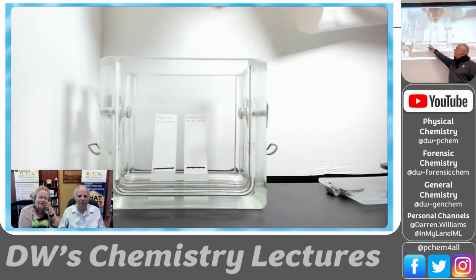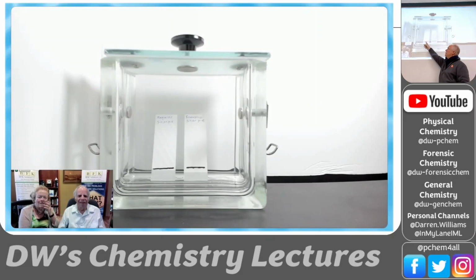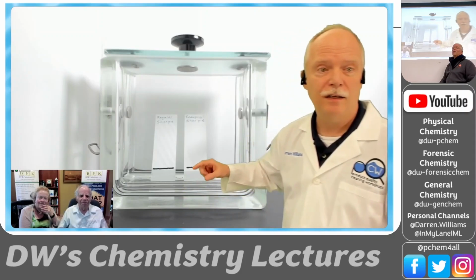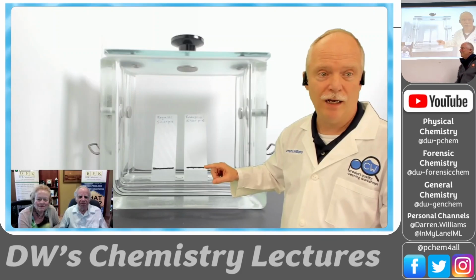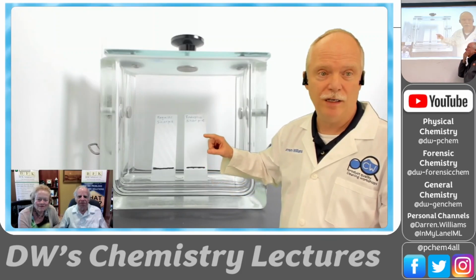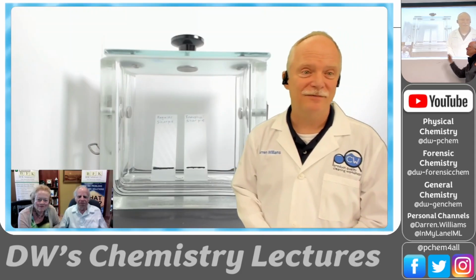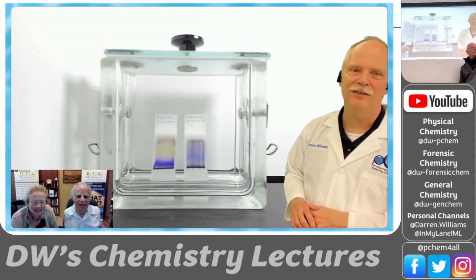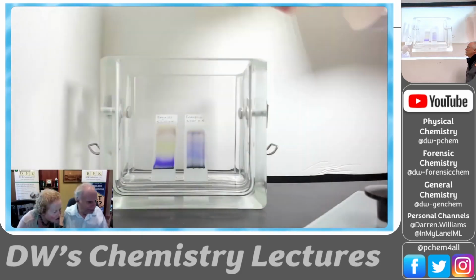You can see the solvent already moving up, and you guys can watch it happen in real time. You can see that ethanol line, pretty sweet setup too. The eluent is pushing up, and it's going to interact with that black stripe, and it's going to push those compounds up, and then we'll stop it close to the end of the lab. And you can tell that the industrial Sharpie and the regular Sharpie are fairly different. Oh yeah, let's pull the Sharpie samples off.